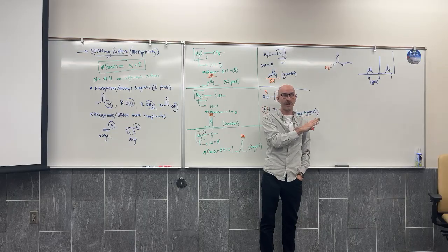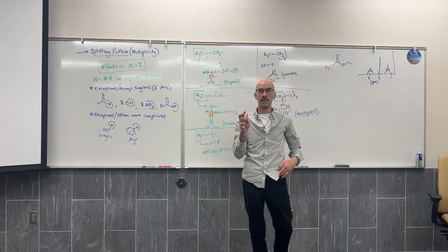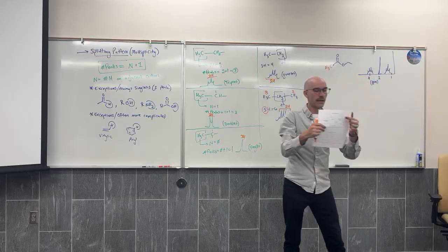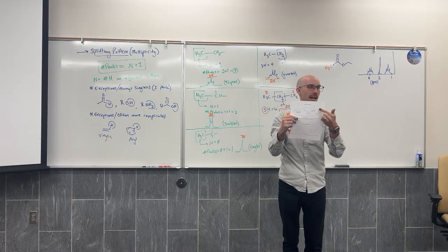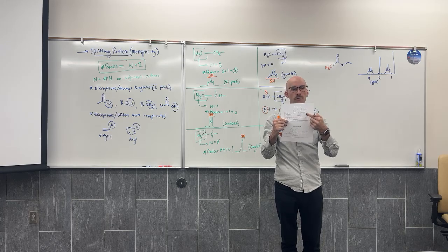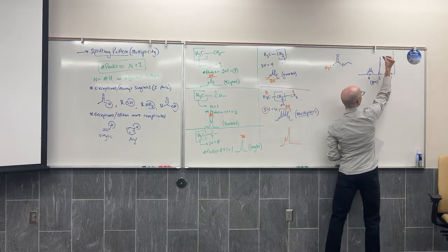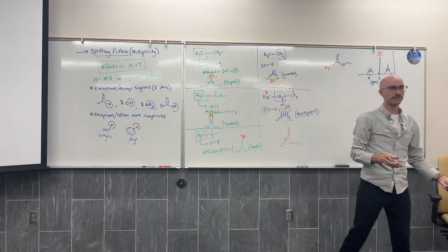Now I only have one singlet, but I can also leverage chemical shift. This methyl group is adjacent to a carbonyl, and according to the correlation table, being adjacent to the carbonyl puts you on the right-hand side, the more shielded side of the functional group adjacent, so closer to 2. Close to 2, I have a singlet that must integrate to 3H.